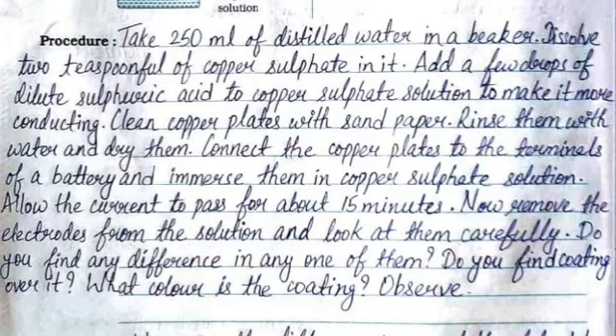Dry the plates, then connect the copper plates to the terminals of a battery and immerse them in the copper sulfate solution. Allow the current to pass for about 15 minutes. Now remove the electrodes from the solution and look at them carefully. Do you find any difference in any one of them? Do you find a coating over it?